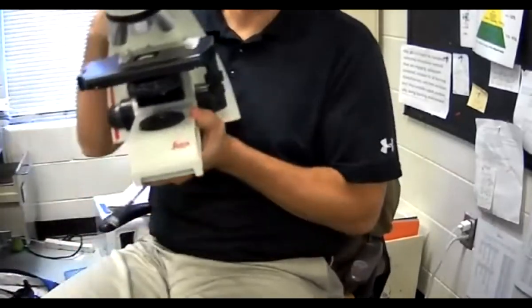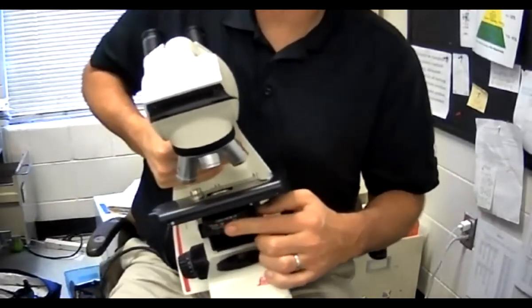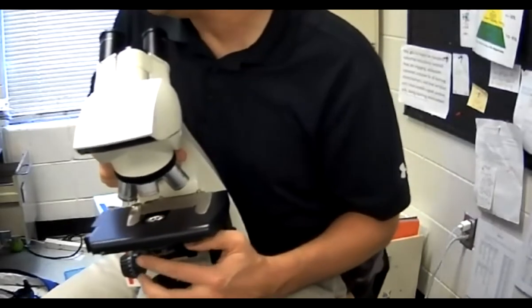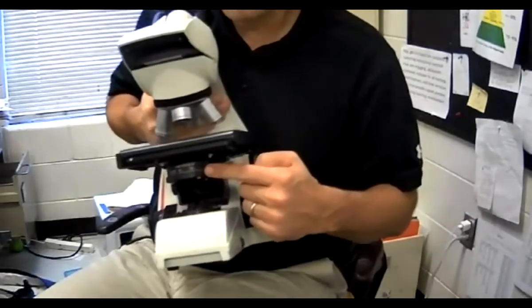This thing down here that's right in the front is called the diaphragm ring. It controls how much light goes in and out. It's called the diaphragm ring.